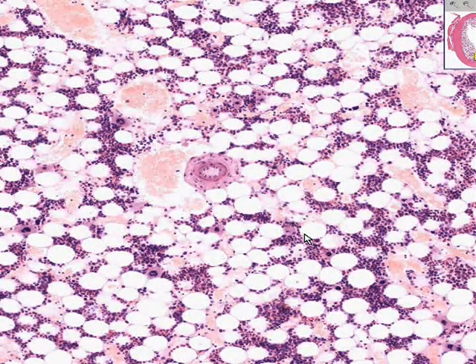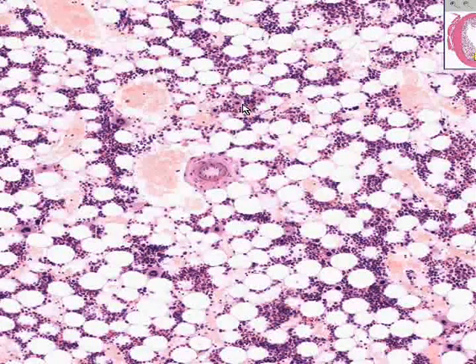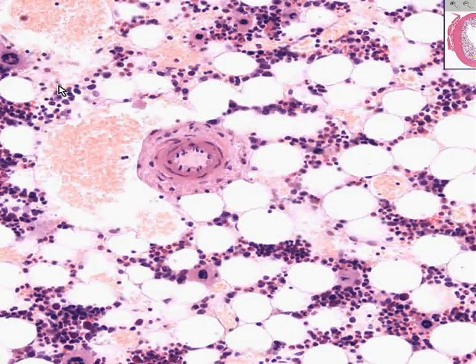And the cells make red cells, white cells, and platelets. And the precursors of platelets are these huge cells, which we see here, and here, and here, and here, called megakaryocytes. And the rest of these generally circular cells, which we're not going to be able to really identify with a great amount of confidence, are going to be making your red cells and white cells, or myelopoiesis and erythropoiesis.